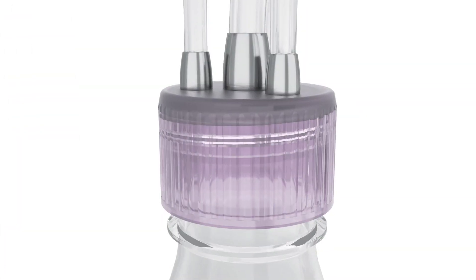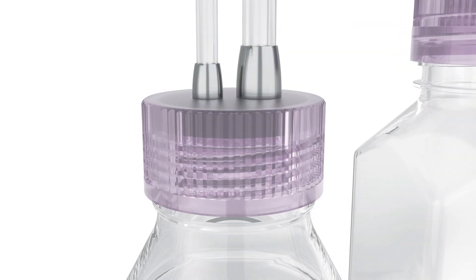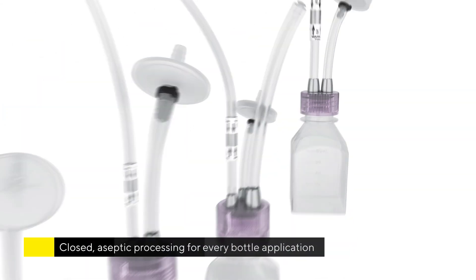The closure of every MyCap is the same, regardless of the bottle, tube materials, or port configurations. This one-for-all closure eases validation and simplifies the supply chain.